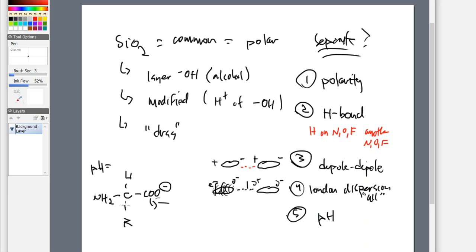All right. So when we say polarity, I need you to understand that polarity is really just the first thing that we talk about. It's kind of the priority that we always just blurt out, the first thing that we go to when we make these decisions. But folks, these components can have similar polarity values. And if they do, then why are they beginning to separate on the silica plate? If they're the same polarity value, shouldn't they be traveling up the plate at one time in one big blob? And they could, but at the same time, there are other pieces to the puzzle.